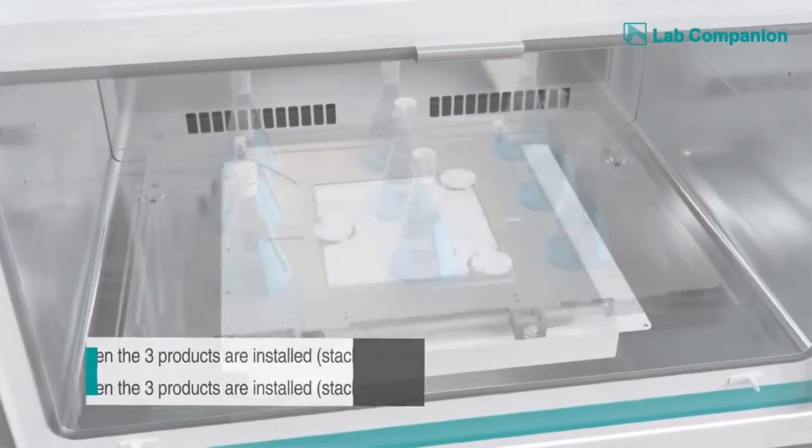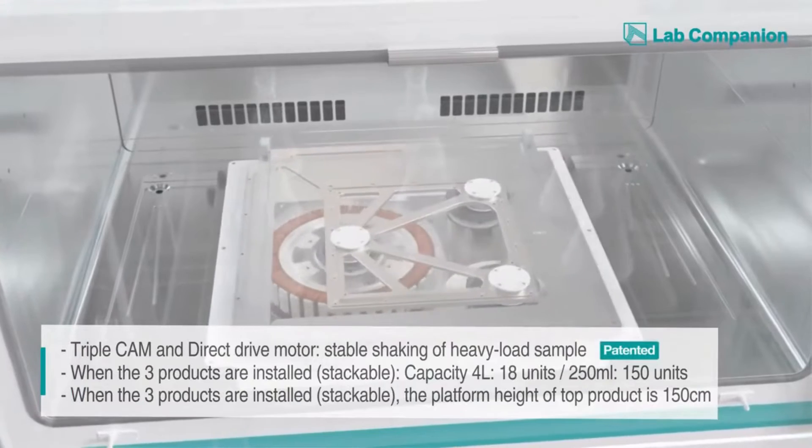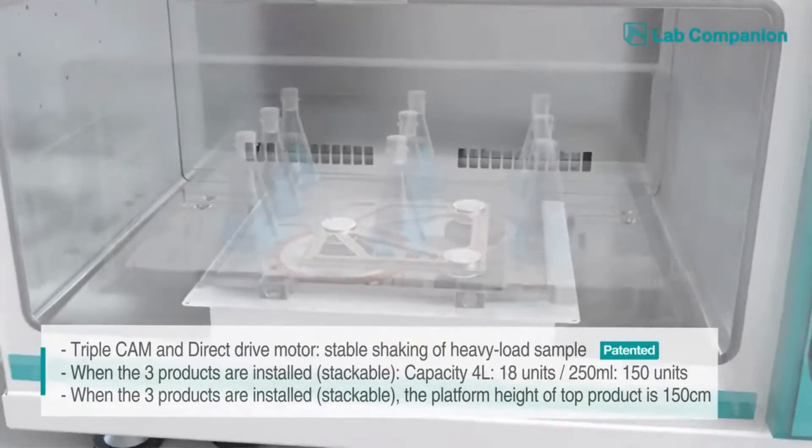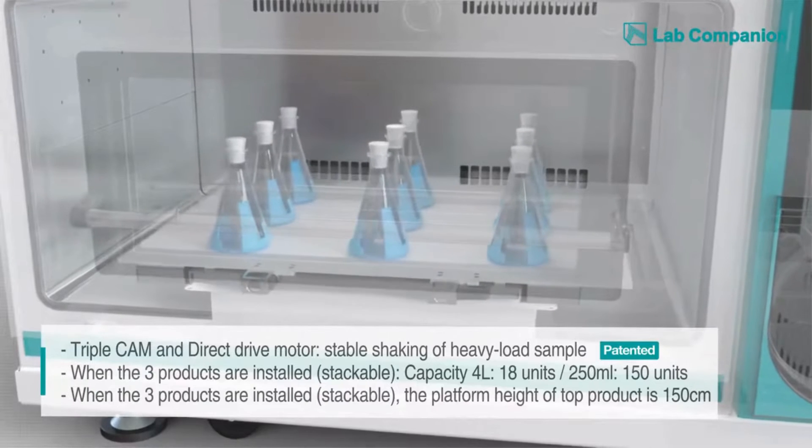By adopting the triple cam system and DD motors, our product achieves the minimum level of vibration as well as the maximum level of stability when stirring a heavy load sample.